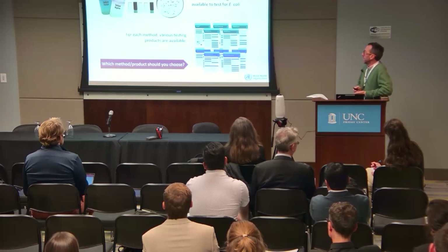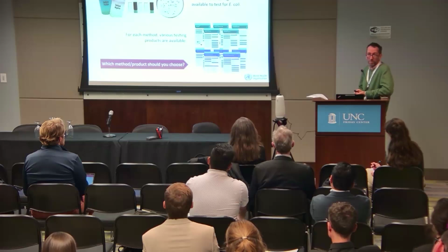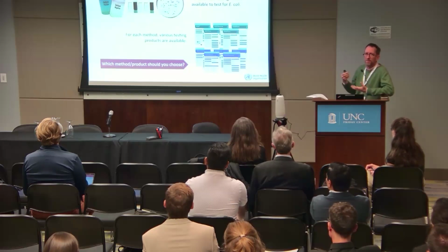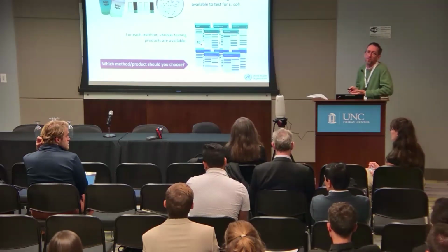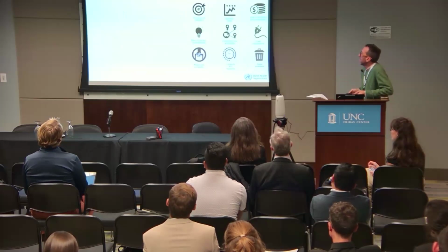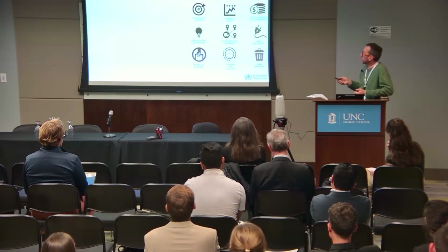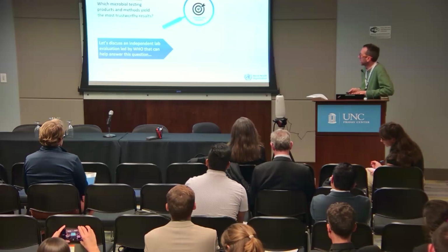There are lots of different testing products available, testing methods, and it can be really confusing and difficult to make a selection among a product. This definitely applies in a lab setting, but there are more variables and more considerations if you're going to be trying to do that testing outside of a lab environment in the field. We just discussed that there were a lot of different factors that could be considered. The purpose of this evaluation was to focus in on the accuracy and precision of different methods.